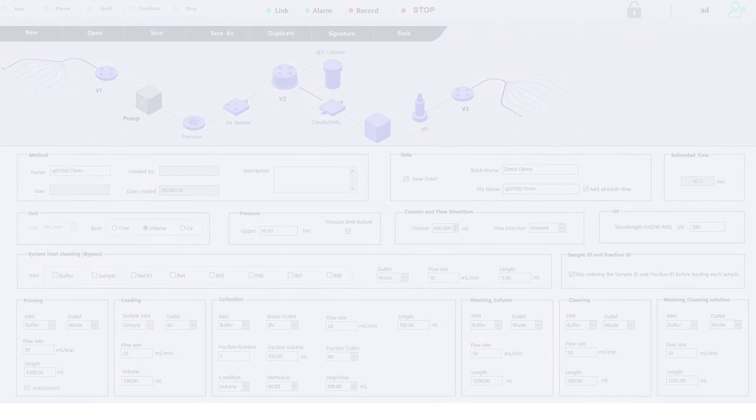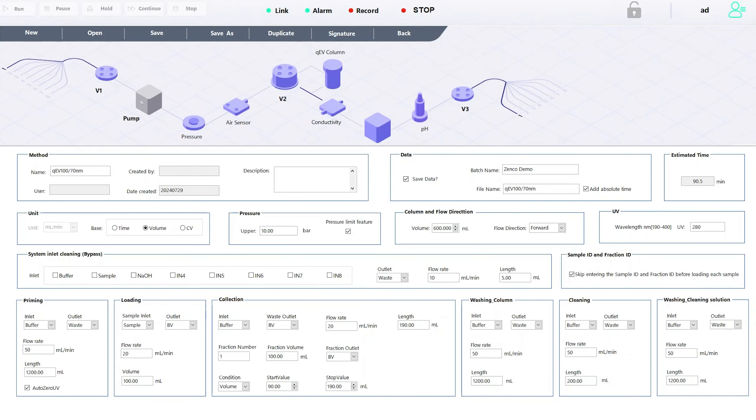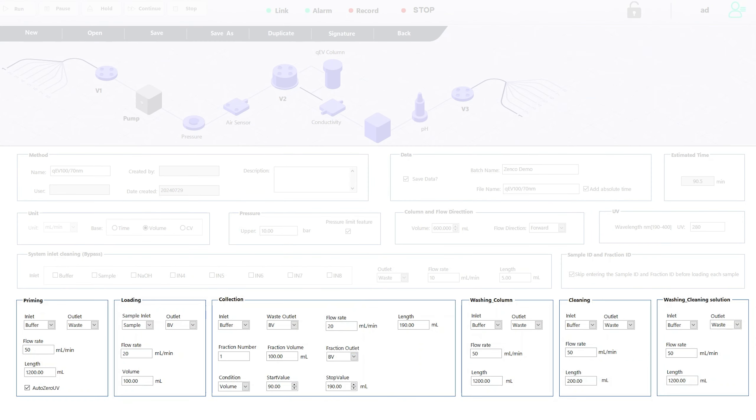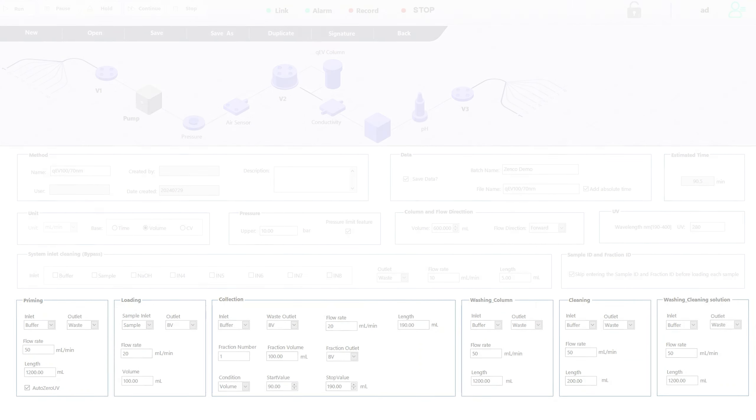When setting up your method, you have precise control over multiple parameters, which are accessible here. Priming, loading, collection and cleaning processes can be configured at this stage too.